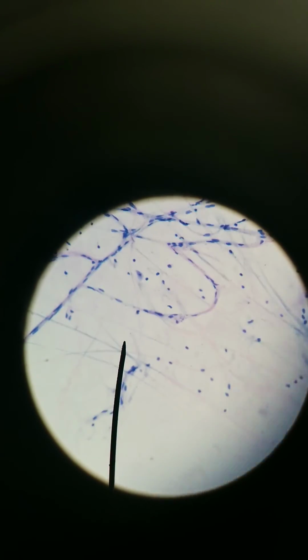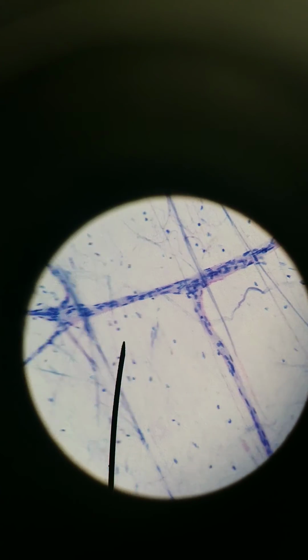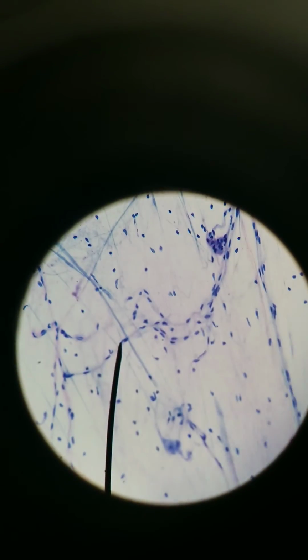Let's show you one more example of the cell body. Nice clear one. Where are we? Lots of axons. Let's go to 100x again.